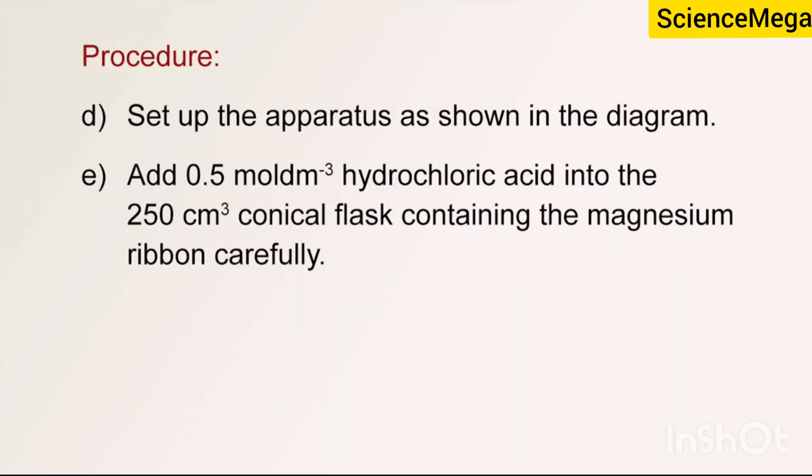Add about 0.5 mole per cubic decimeter hydrochloric acid into the 250 cubic centimeter conical flask containing the magnesium ribbon, carefully.